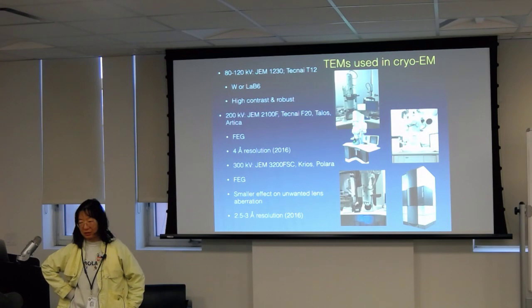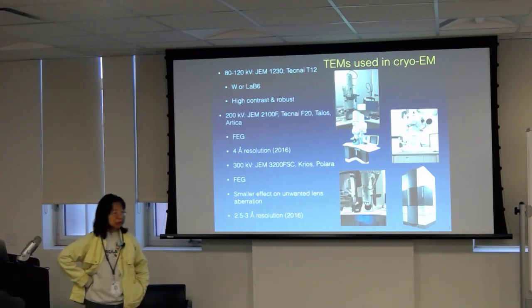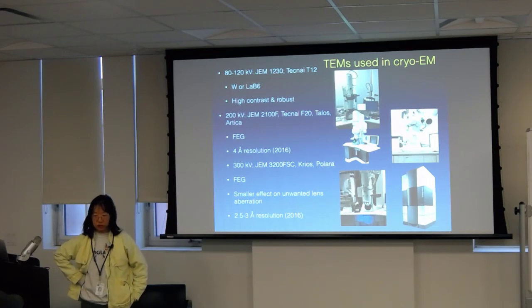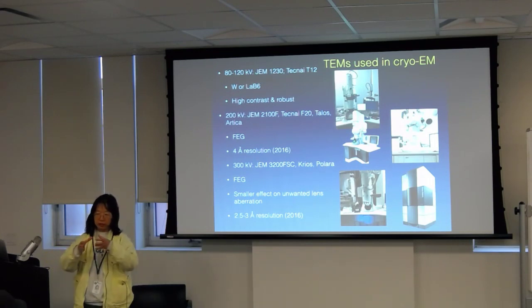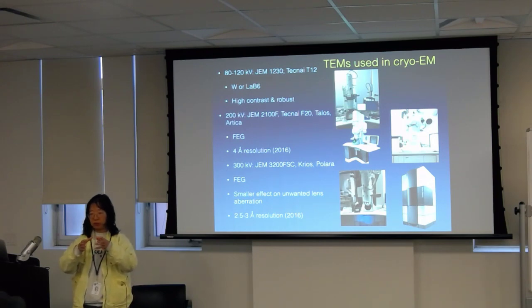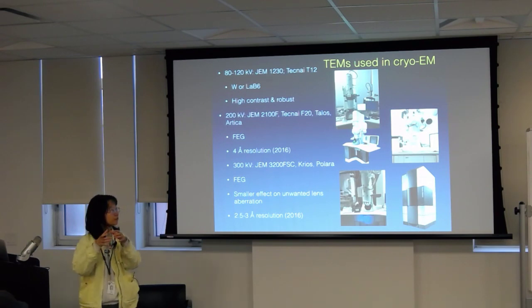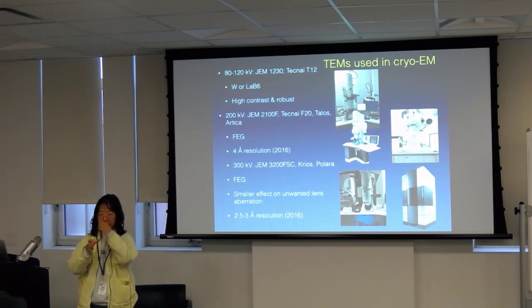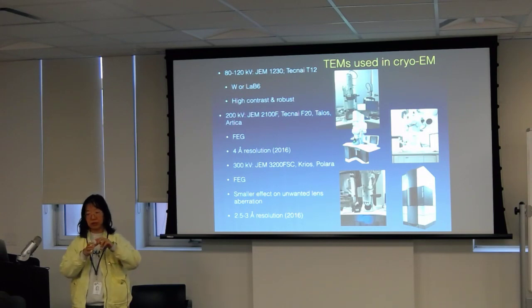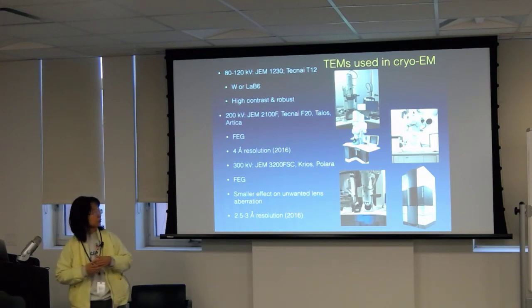So that's pretty remarkable. Okay, so this microscope, they don't have quite as good an optics. As I said, the lens, you can make it better by giving it more power to make different kind of changes to it. And it's not quite as good as the one that they put in on the highest end microscope.